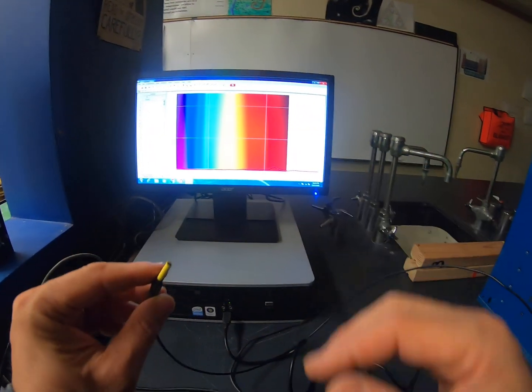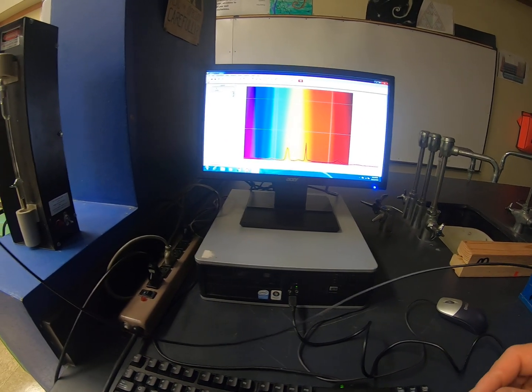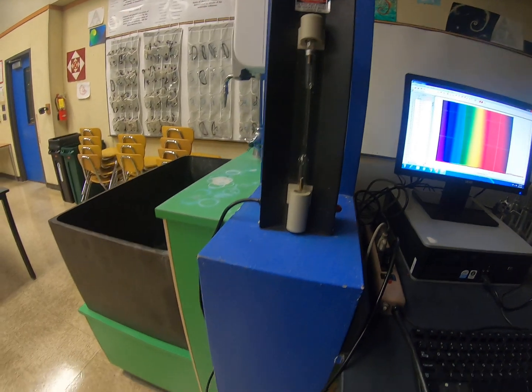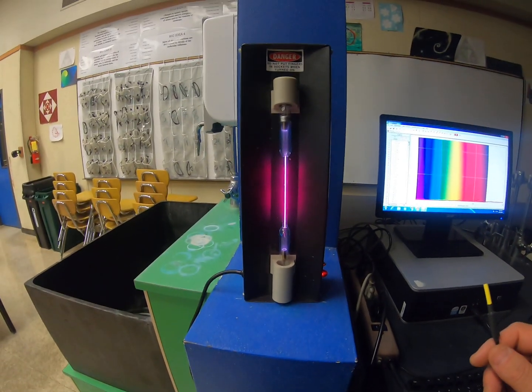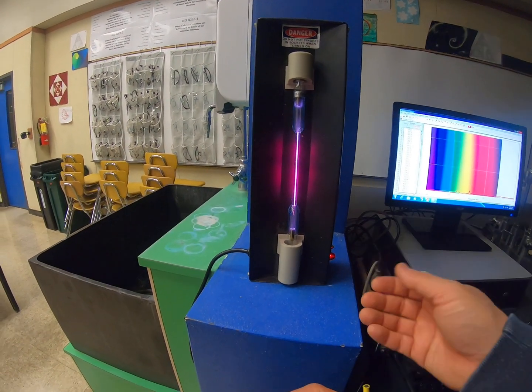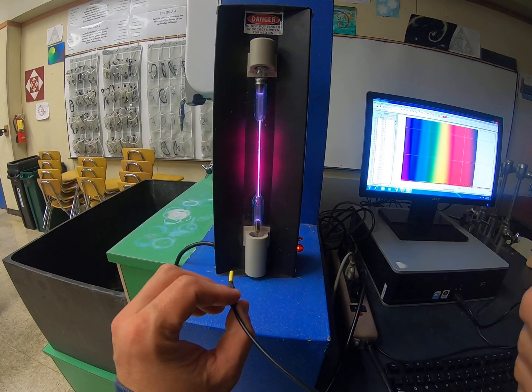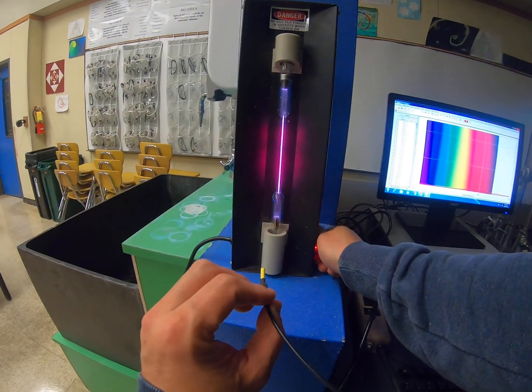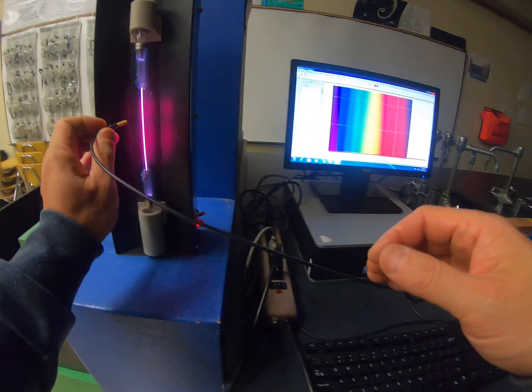So spectrophotometers are good at reading light in an accurate, precise manner, and we can actually look at some of our elemental gas tubes. So I've got hydrogen in here, and I just want to show you, hydrogen to our eye looks pink or magenta. But hydrogen's one electron is transitioning between different orbitals, or energy levels, and when they fall back down to the ground state, they emit photons. And depending on the size of the transition, whether it's jumping from the second energy level to the first or the sixth to the second, you get different color light.